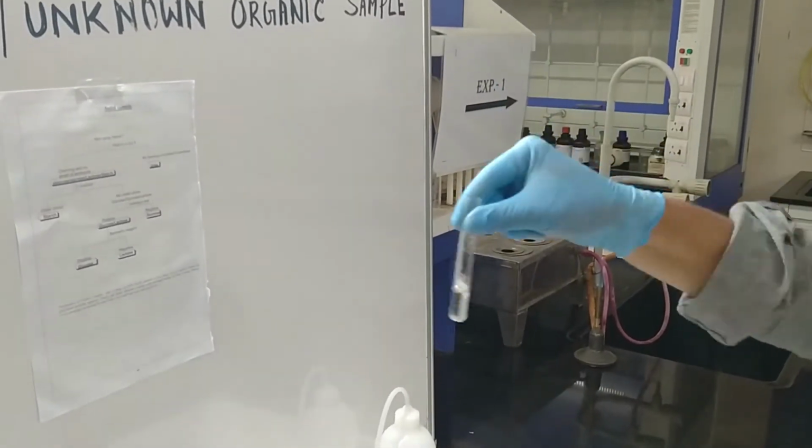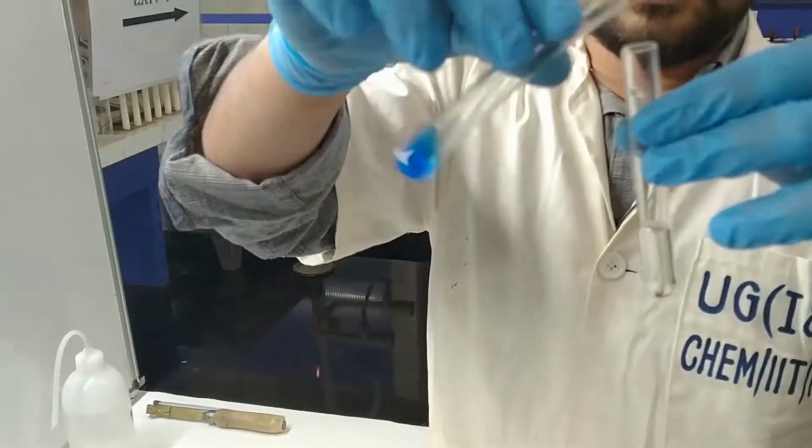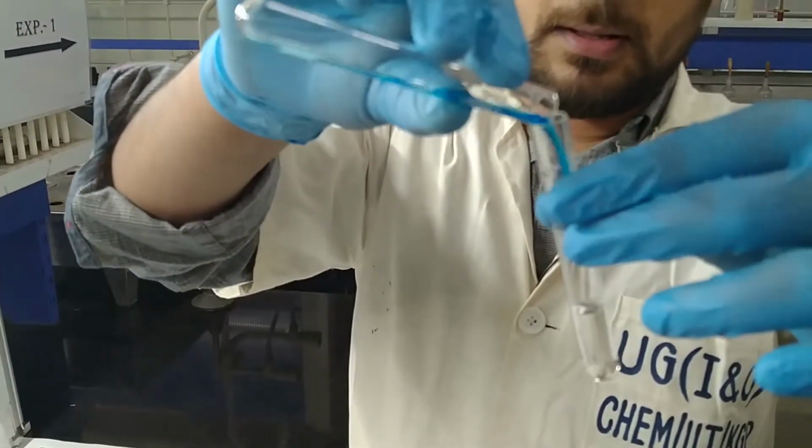Aqueous solution prepared. Now I pour the prepared Fehling's reagent into this.